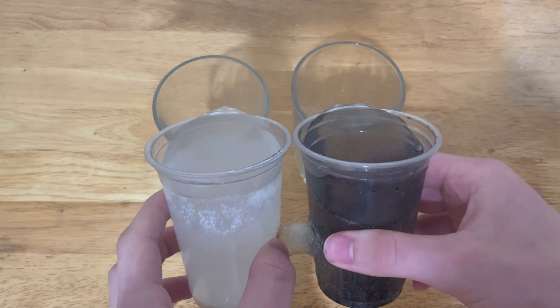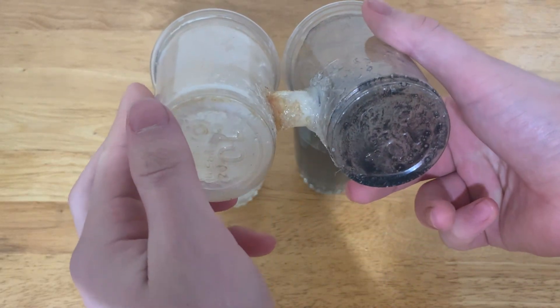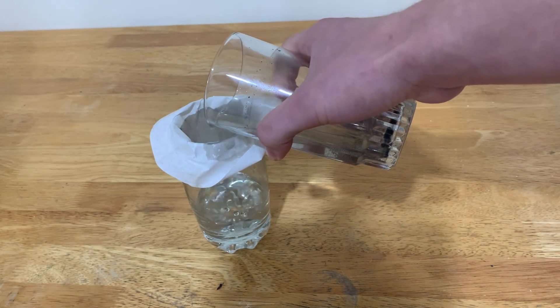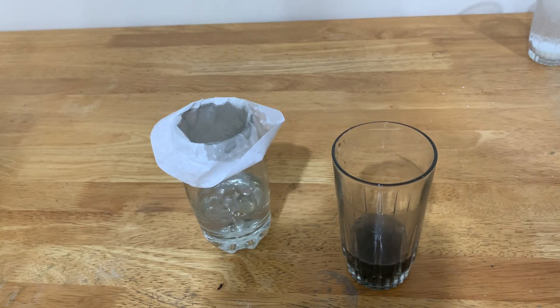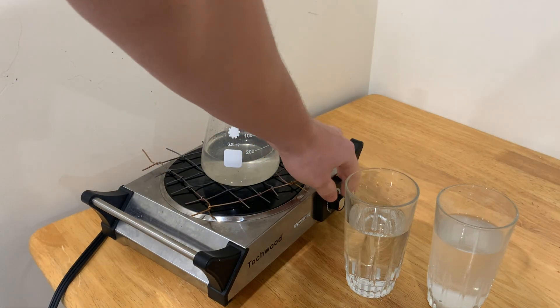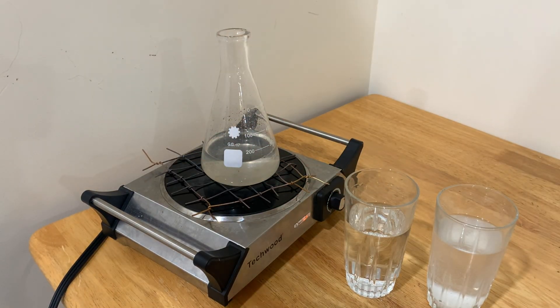Now that I've transferred these two into cups, I then filtered the solution with the acid inside through a regular coffee filter, just to catch any of the graphite chunks floating around. Now the acid can be heated up and brought to a boil to boil off any of the excess water.